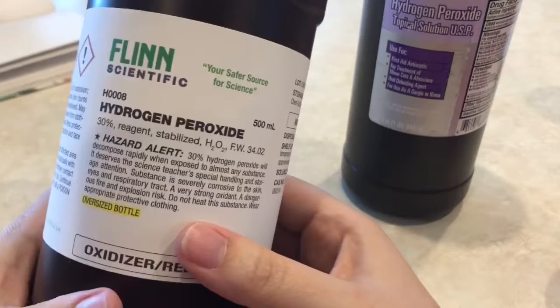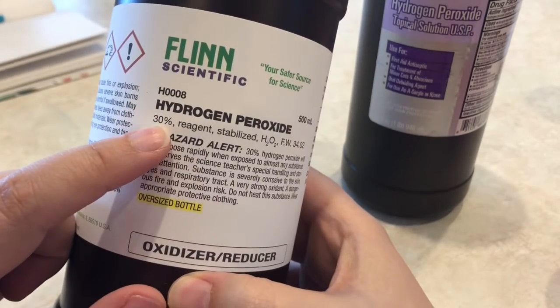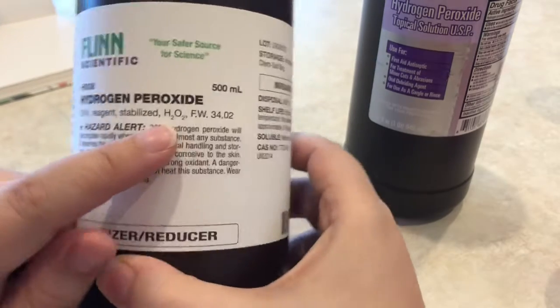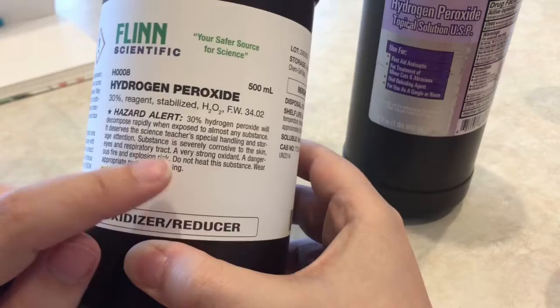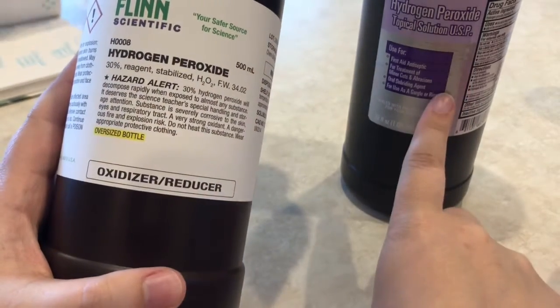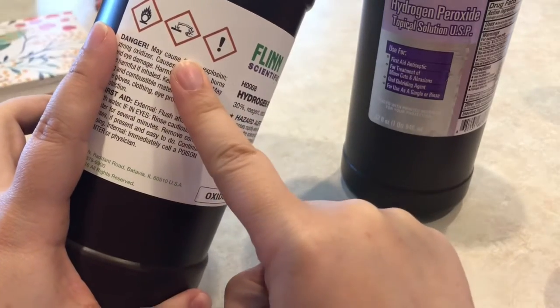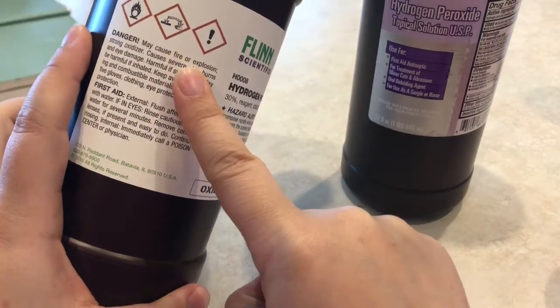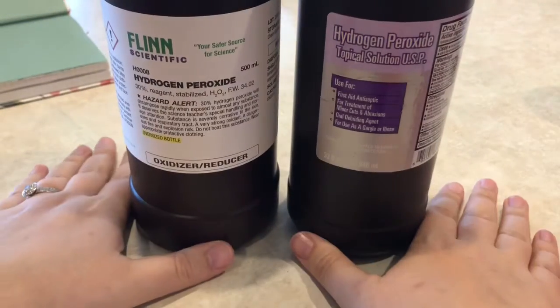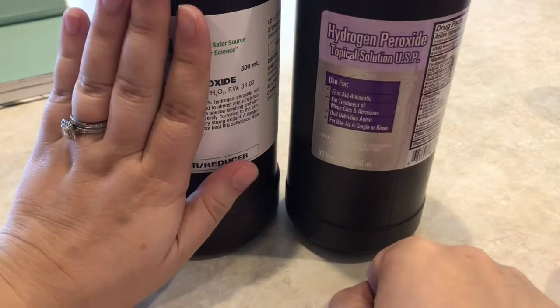This one though, this is the souped up version of hydrogen peroxide, and this one is 30%. So this concentration is a lot higher. There's a lot more actual H2O2 molecules in this bottle than in this one. So we have a high concentration and a low concentration. This stuff is not safe to touch. I'm going to be really careful when I'm using it. It's not safe to touch. I don't want to get it in my eyes. But we're going to see what kind of reaction happens if I do the catalyst in the low concentration versus the catalyst in the high concentration.